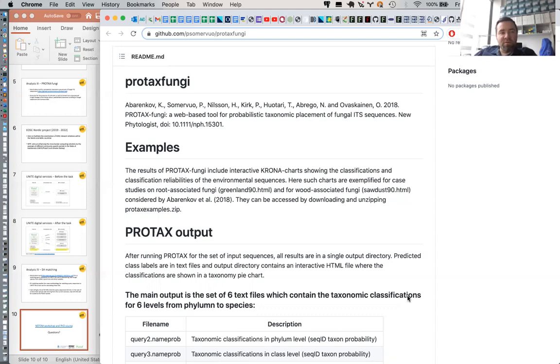Just the taxonomy? Well, our version, the current version, is I think running on PlutoF taxonomy and the UNITE full sequence data set, not just the ones that are in species hypothesis. But you would need this reference database and the classification.